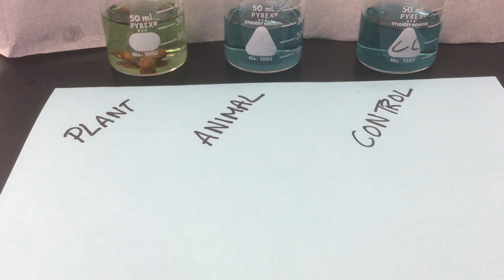All right, I'm about to take a straw. I'm going to exhale into our animal beaker. Try to do so for about 30 seconds, and we'll see if we get any color change there. Just as a safety tip, just so you all know, I am going to wear goggles so that if this were to splatter at all, it won't get into my eyes.